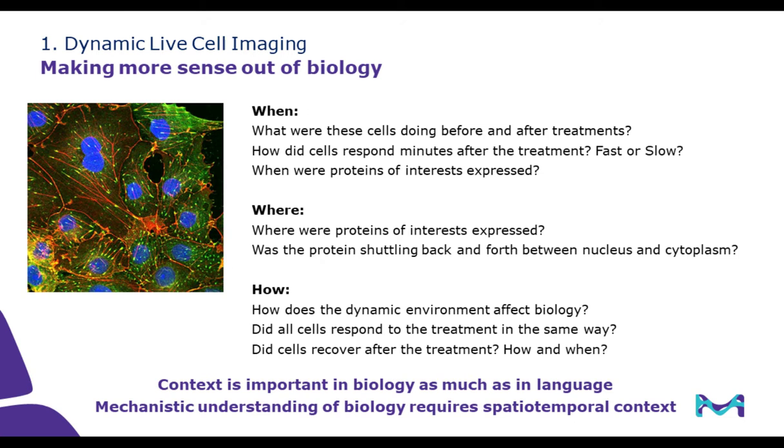So how can we see everything that happens in one experiment? The answer is live cell imaging. So it allows us to answer questions like when, the temporal information. So what were cells doing before and after the certain time points? And how did cells respond minutes after the treatment? Is it a fast response or a slow response? When were proteins of interest expressed?